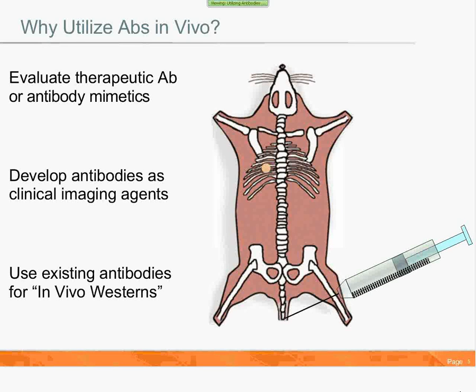How all of these systems would work is that you would inject either a fluorescent or radiotracer labeled probe throughout the animal. After a long circulation time, it will clear away from the rest of the body and stay bound at the target site. Those clearance rates are actually a key variable that one has to understand when trying to set up antibodies.